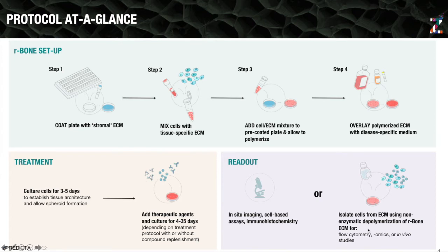Then after treatment, we can do various readouts. We can actually do some real-time imaging while the culture is ongoing, while the treatment is being applied. And I'll talk a little bit more about some of the instruments, but in this case, we're using TECAN Spark Cyto, which provides, if we want a time course imaging set, we can actually get the cells imaged within the exact same spot, so we can really follow, say, a spheroid throughout its lifetime of culture and being treated.